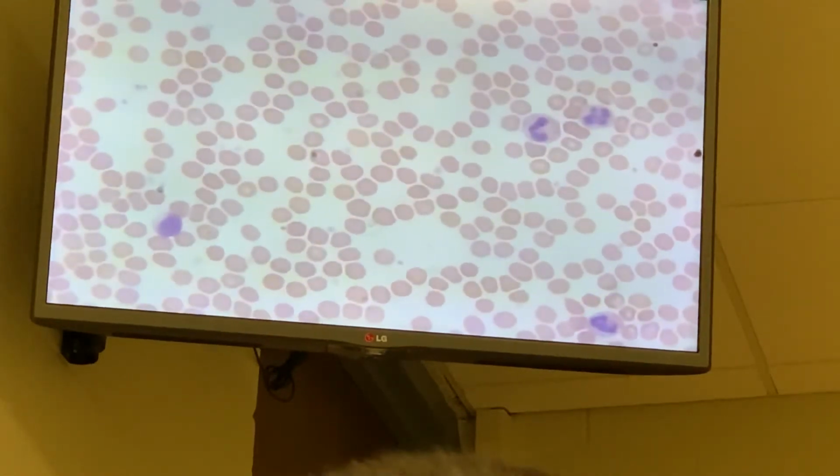Okay, now comes the hard part: eosinophils and basophils. If I can find an eosinophil, which you generally can find more readily than you can find a basophil. But I'm searching. In the interim, I found this one. What do you think this one is?